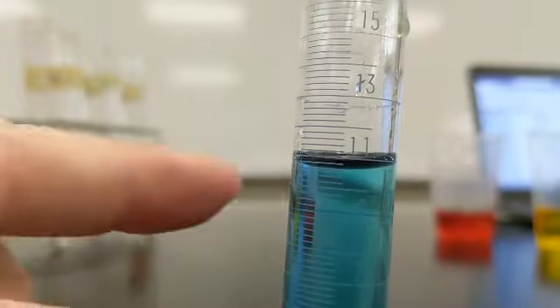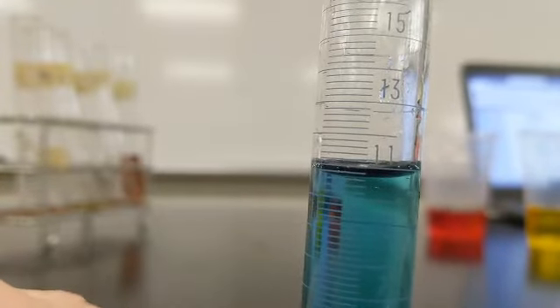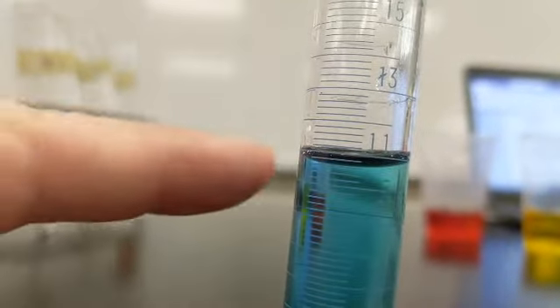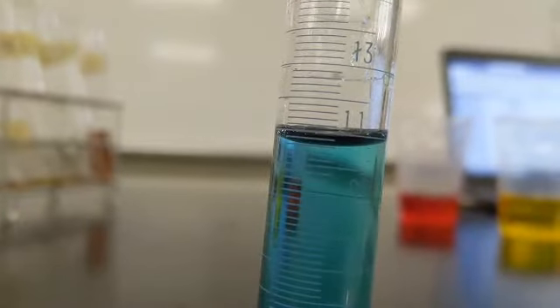You can really see that curve. That's caused by the surface tension of water. Okay, the water molecules want to stretch out. Even though they're sticky, they want to stick to the side of the cylinder, and that makes them sort of creep up each side of the cylinder. Okay, 10.6.